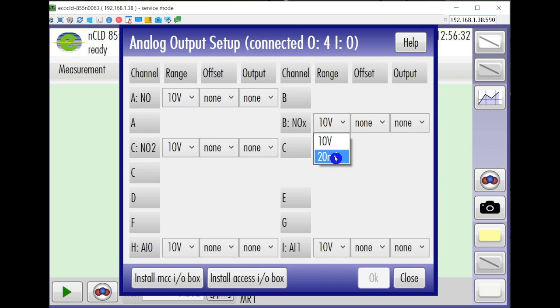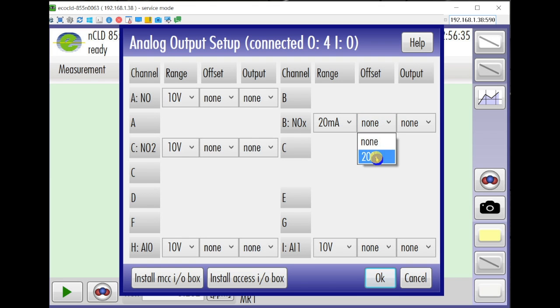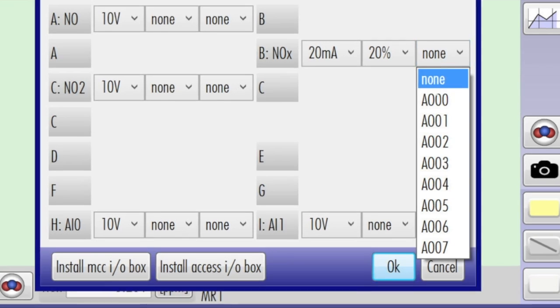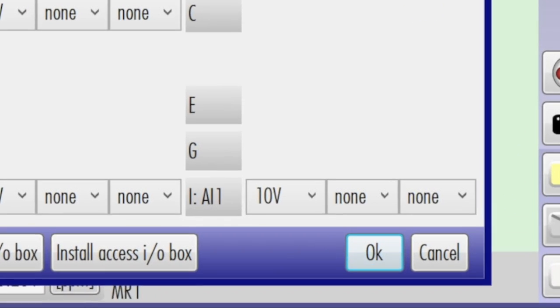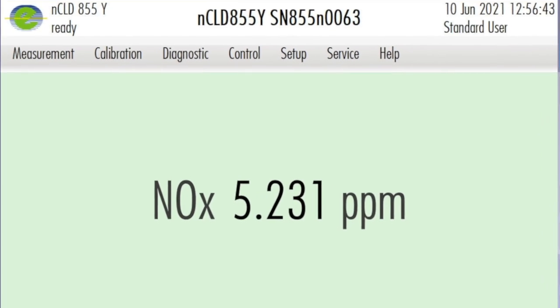For the signal type or ring choose 20mA and for the offset choose 20%. The output number corresponds to the pin out position on the USB 3102 box. So output A000 corresponds to IO 0 on the USB 3102 box.